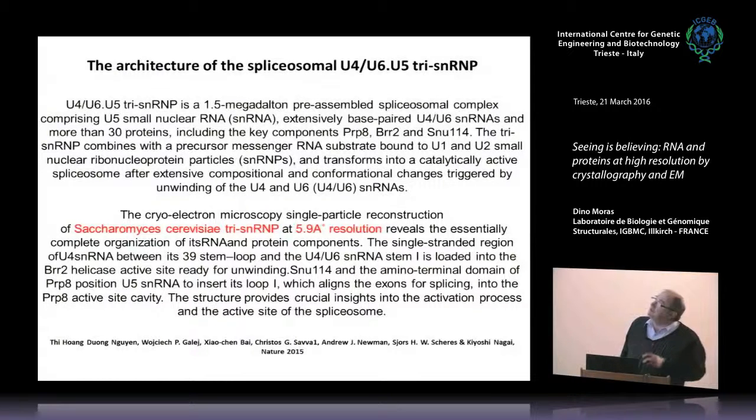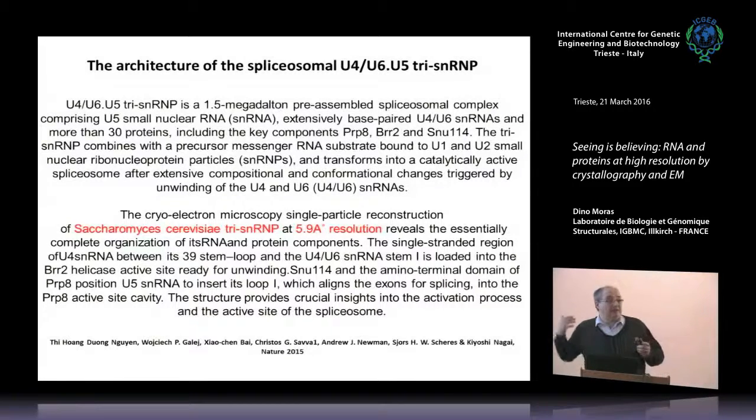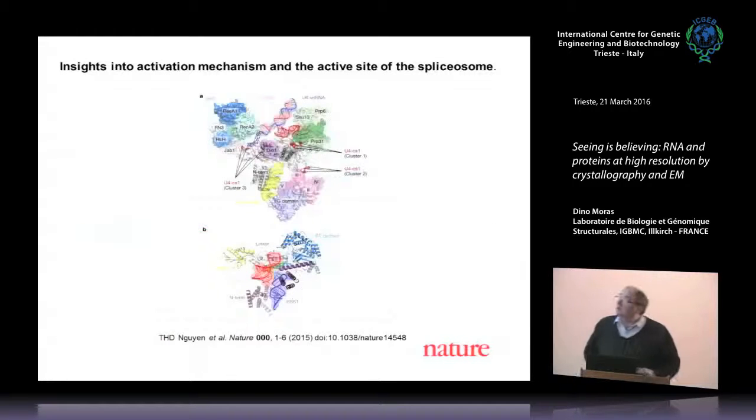And here is from the abstract that you can go through, I have no time to go there. The structure provides crucial insight into the activation process. Essentially, it shows the architecture. At that resolution, it would have been a bit presumptuous to pretend that they have the molecular detail. So the architecture, that is putting together the modules known by crystallography, is what they could extract safely. But when you have that, you can reach that model.